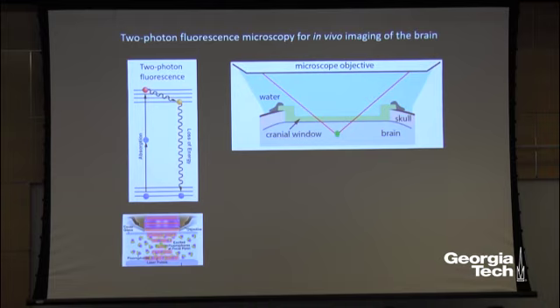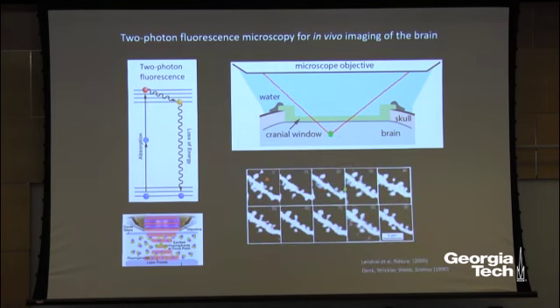So now, then how do we do the experiment? How do we take image? So with 2 photons, you can focus your excitation laser into the brain. And then at this focus position, you can record how many fluorescence photons coming out. And to form an image, you basically just scan this focus in 3 dimensions inside the sample, and then you will get a micrograph of the fluorescent molecule distribution. And as you can see, this imaging method has a type of resolution that allows us to see individual synapses, as you can see in the form of dendritic spines here.